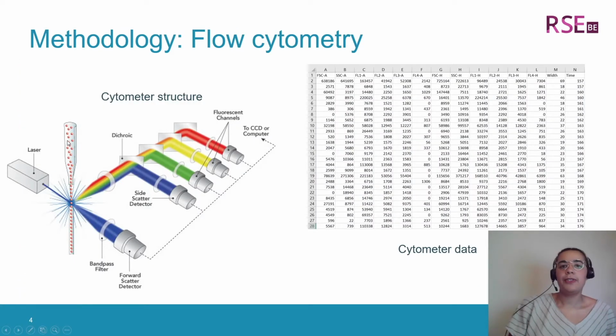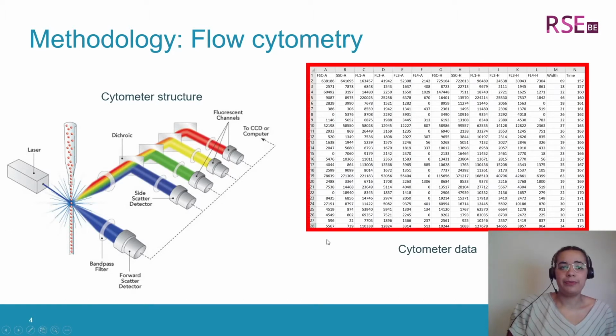A flow cytometer is a machine where particles enter one by one through a narrow tube. When each cell is hit by a laser, the reflected, absorbed, or non-absorbed light will be analyzed by different channel detectors and converted into numeric values. These data indicate the size, the granularity, and the fluorescence of the bacteria. And we use this data to differentiate species with machine learning because we cannot do it by eye.